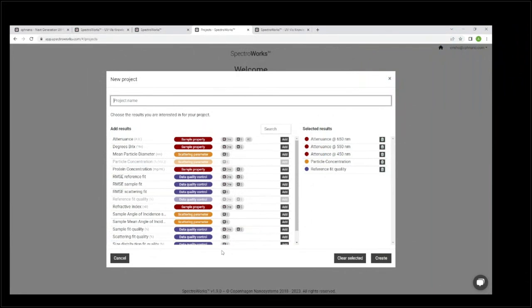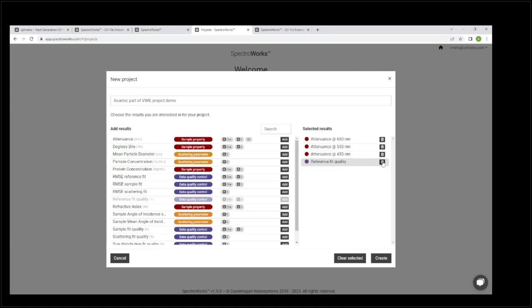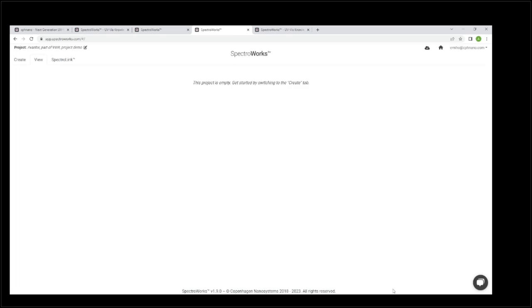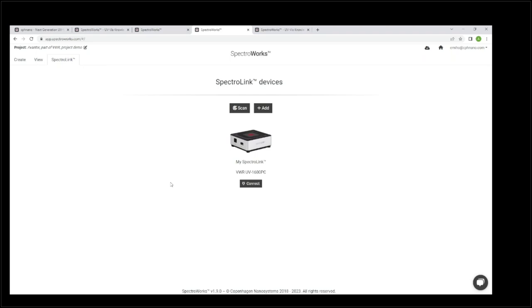I'm going to click 'new project'. Here you can see a number of different possibilities to add parameters to your project. I'm just going to call this one 'Avantor part of VWR project demo'. Over here, today I don't want to do particle size analysis, reflectometry, or micro volume measurements. So I'm just going to say all I want is attenuance at 650, 550, and 450 nanometers. I'm going to click create. Now it's setting up my new project — and since I have already connected my device, it will show up inside the software. I'm going to go ahead and click connect.